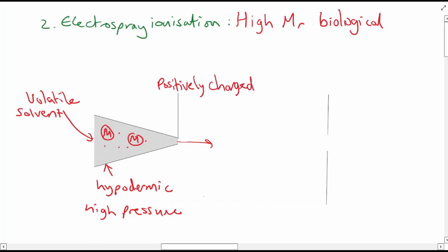And this is where we kind of get a little bit vague. So what we're going to say is, through this process, M, the large molecule, as the solvent that's volatile means it evaporates really easily, it leaves behind protons. And these protons stick to the large molecule, and you get this MH+. So we'll say this is a gas, and we'll say this is a gas as well.